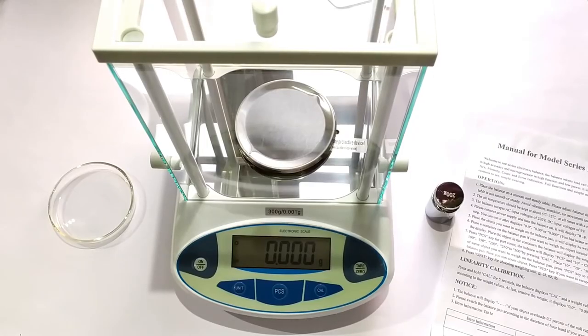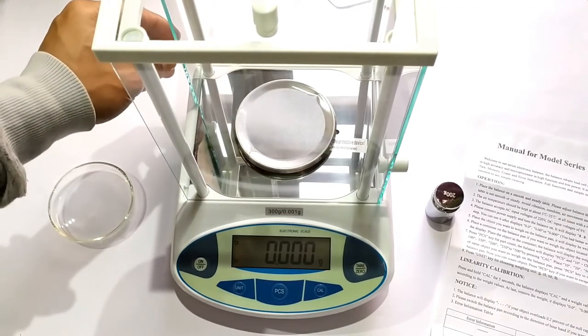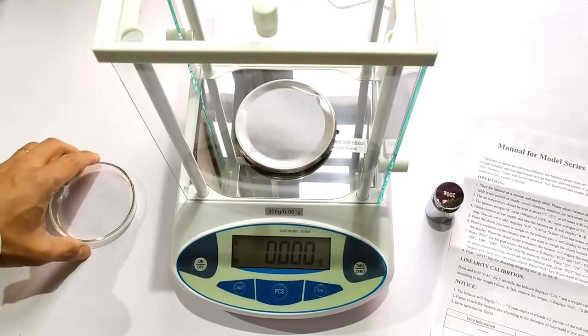Now that the device has been calibrated, let's see how it performs. We place a weighing container such as a petri dish onto the weighing pan.